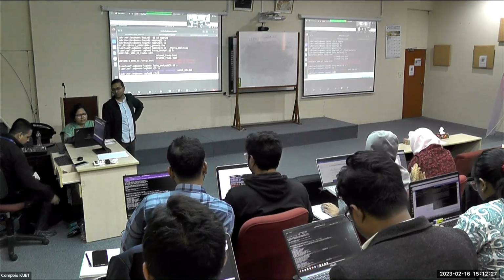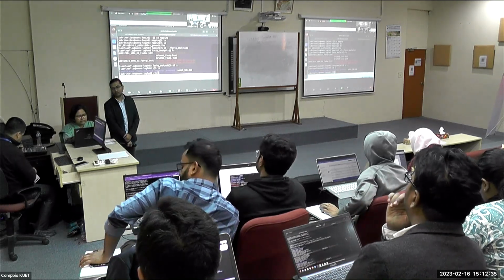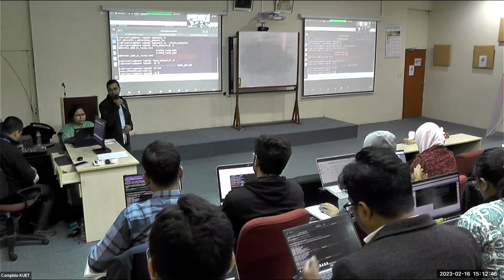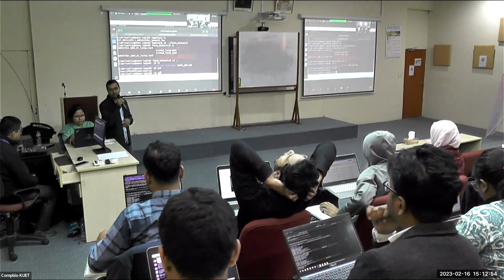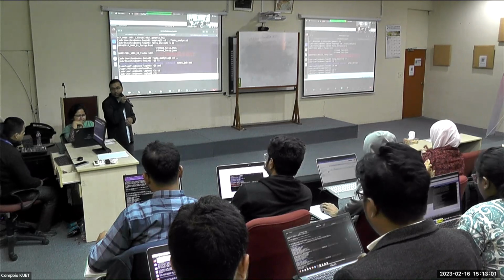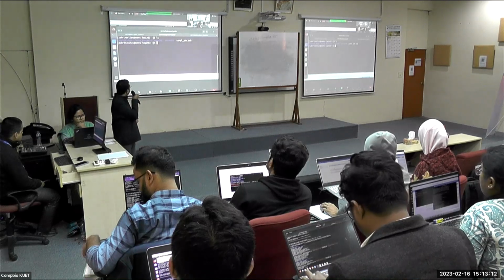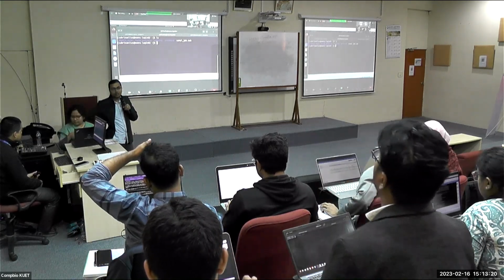So now we are outside both the mapping folder and the FastQ folder. Here is the user home. If you are in another directory, type cd only, then you will go to the home directory. So type cd and then press enter, then you will be in the home directory. And you should find the FastQ analysis and mapping folders in the home directory, also maybe some other directories. It should be something like this.